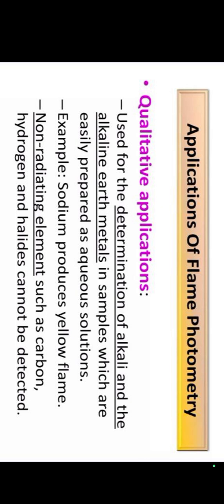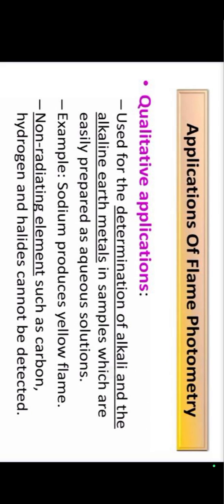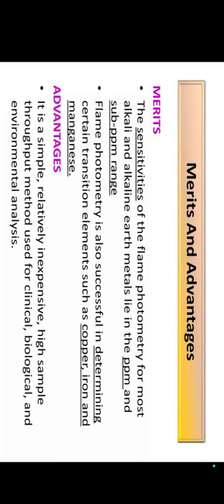We see the qualitative application and the quantitative application. In quantitative application, we analyze water, determine the concentration of sodium and potassium in body fluids, and determine lead in petrol. And we see the merits of flame photometry: the main merit is sensitivity, and it is inexpensive, simple, and a high sample throughput method used for clinical, biological, and environmental analysis.